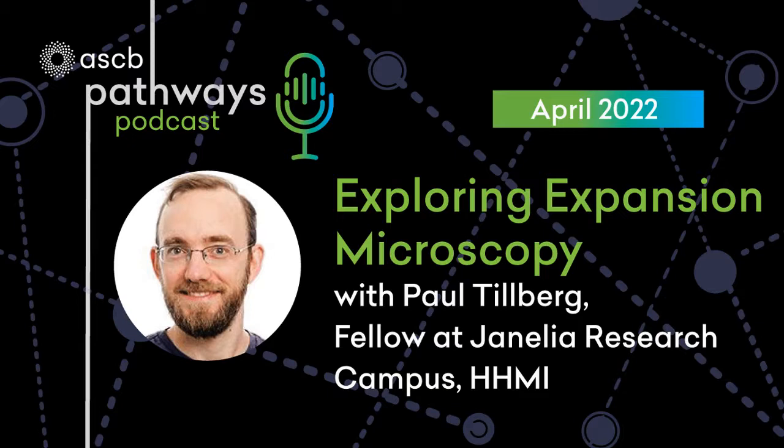The other one is that in the EASI-FISH paper, we show a finer degree of parcellation of the hypothalamus than was known previously. That comes about because we got that large 3D structure that really allows you to search for finer parcellations. It's not like one region is super high in one gene and the surrounding material has none of it.